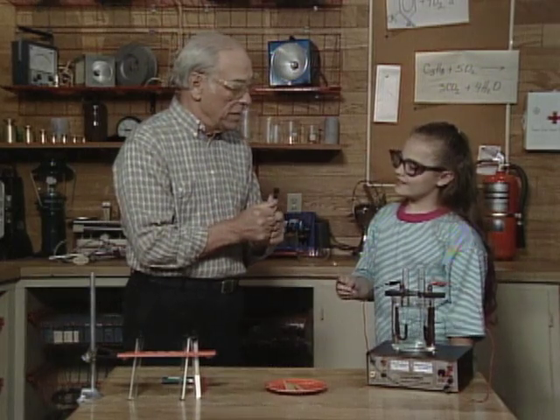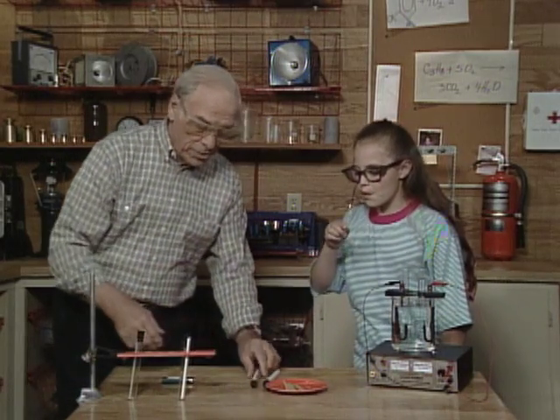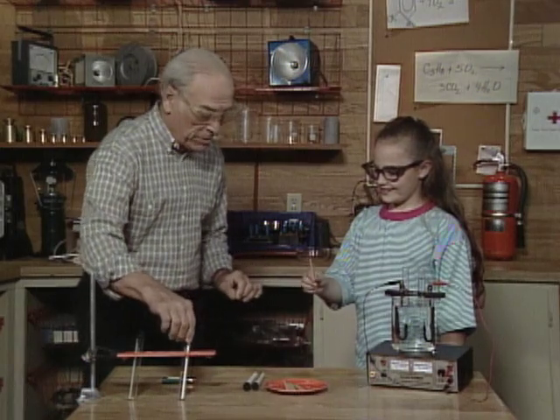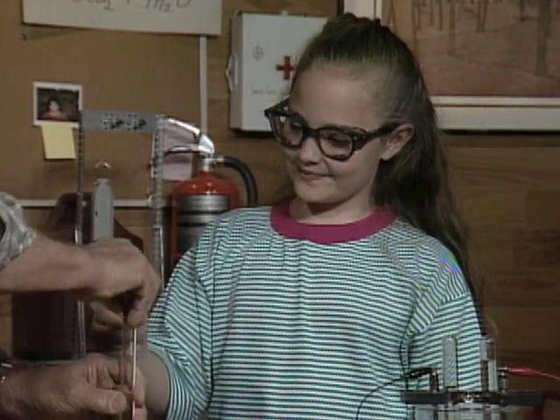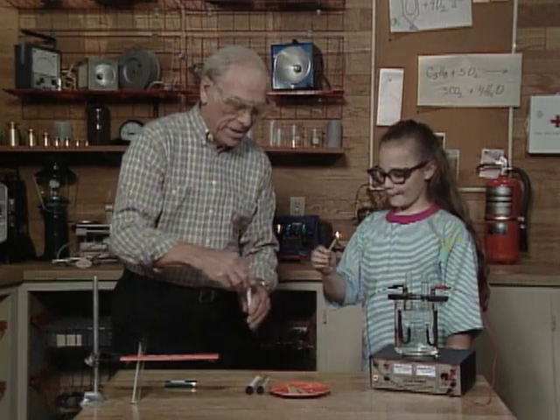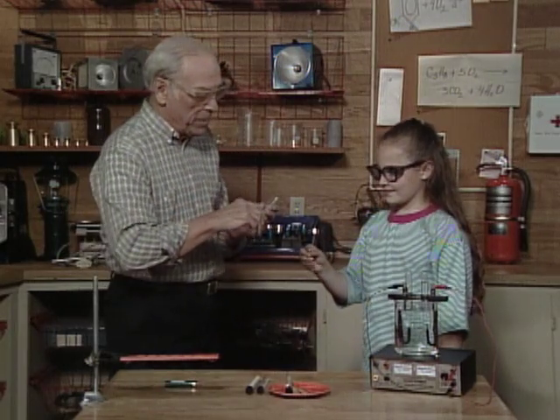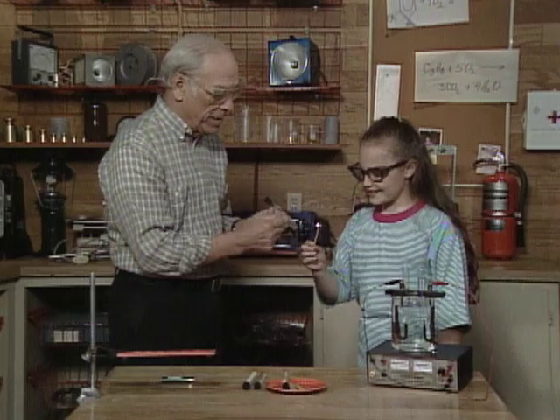Now that you know the tests, we've tested those two. Let it keep going — because now, if this is oxygen, it'll burst into flames again. Try it — there it did! Now here comes the hydrogen — what should happen? It'll explode and pop. There it did! Now you can blow that out.